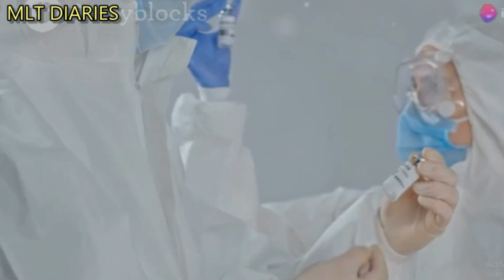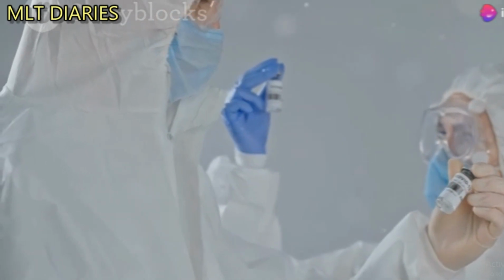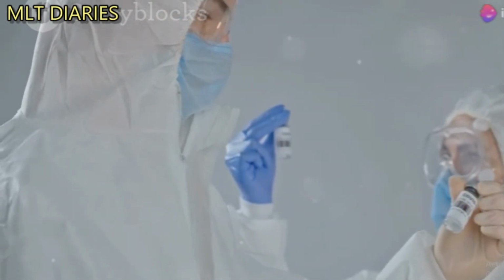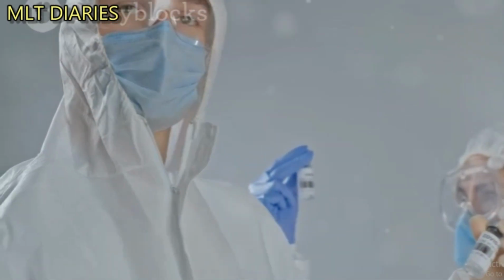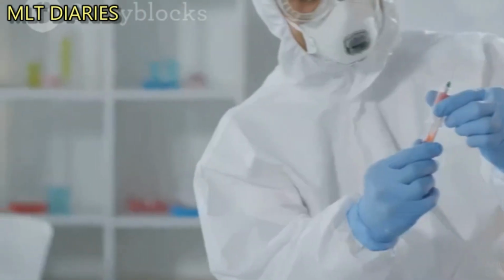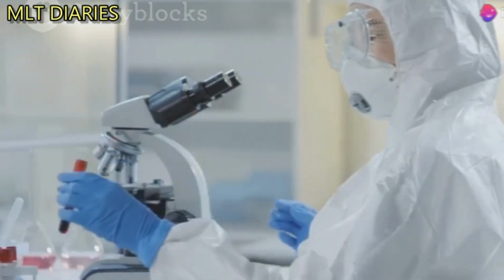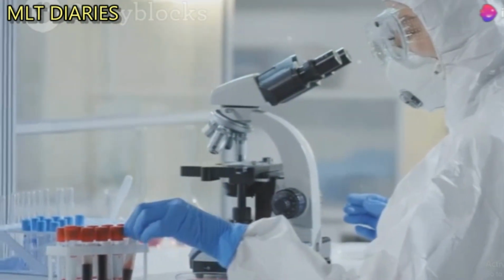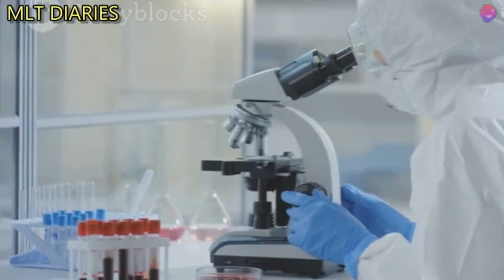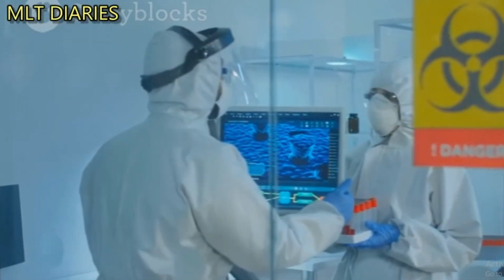In conclusion, using the Laboratory Biosafety Manual effectively involves understanding its structure, performing thorough risk assessments, adhering to biosafety levels, following SOPs, implementing safety practices, being prepared for emergencies, managing waste properly, ensuring training and compliance, and staying updated with the latest guidelines. This comprehensive approach ensures a safe laboratory environment for all.